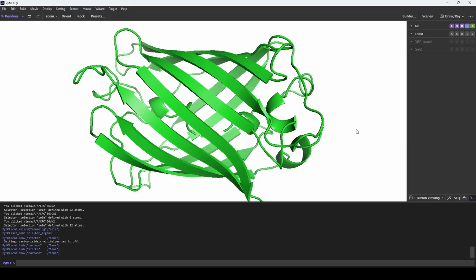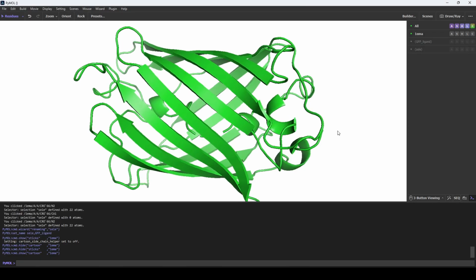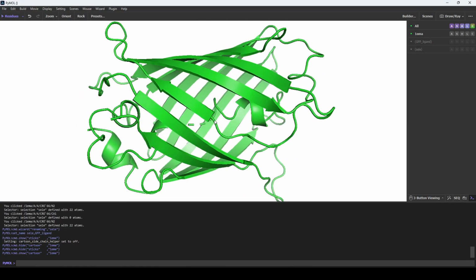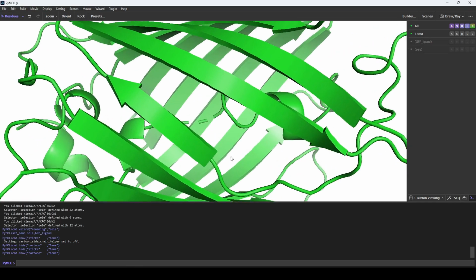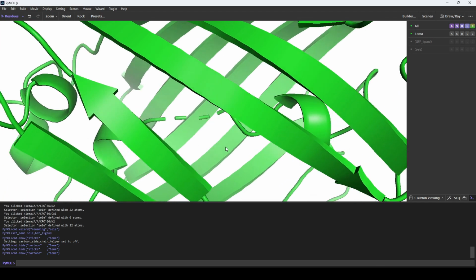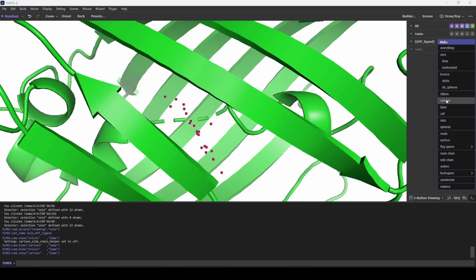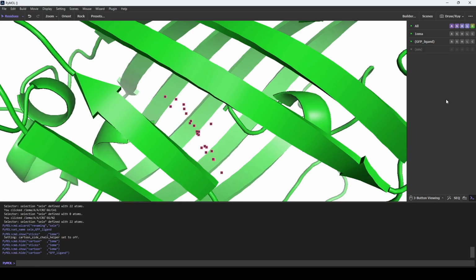You may notice that the ligand is no longer seen, and instead we have these separated loop pieces in the center of the protein. This is the ligand, but visualized as a cartoon. To bring back the stick form, we first need to click Hide the Cartoon of our ligand selection. And now we will bring it back as a stick form.